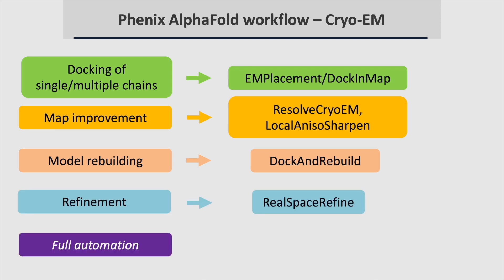If you want an automated procedure, you can use Predict and Build, which will carry out all of these steps to automatically interpret your cryo-EM map.